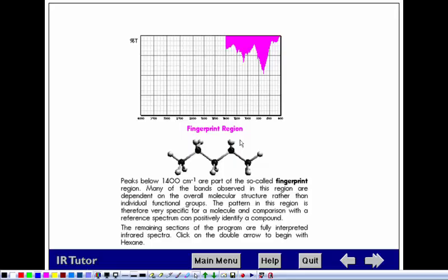All right, so that's infrared. Where we're going to use infrared is to figure out whether a functional group is present or not. That's it. That's how we're going to use it this semester. All right, any questions? So next week we will talk about something else, another topic of spectroscopy, probably UV-vis.